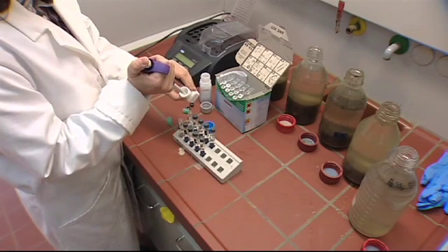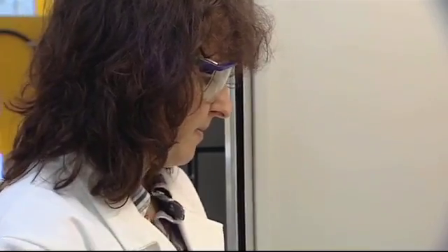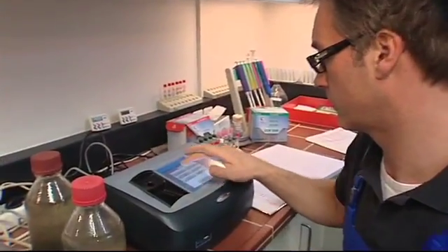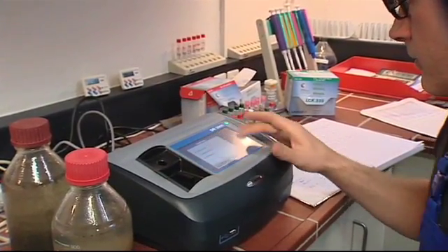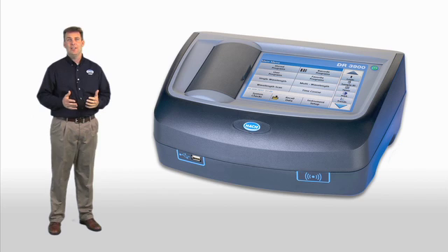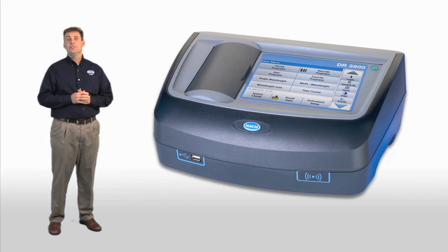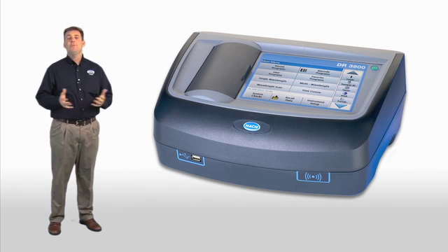Hach Company continues to revolutionize the way the world thinks about water analysis. So much of what we do every day is focused around how we can make water testing simpler, while always providing the quality you expect from us here at Hach. Thank you for being with us today to see what the future of spectrophotometry looks like. We want to answer any questions that you may have about the DR3900 — please type your questions now in the chat window on your screen.